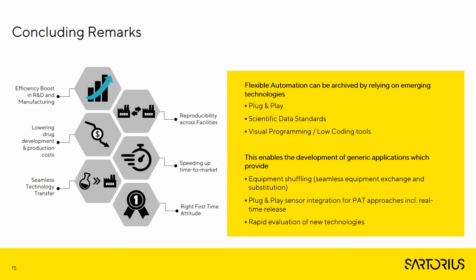This is not limited to robotic automation, and does equally apply to data-driven knowledge extraction via machine learning approaches. The removal of repetitive and tedious data wrangling tasks allows scientists to focus on creative solutions for complex problems again. Business value can be created by democratizing tasks which were previously performed by subject matter experts such as data scientists and IT integrators. These concepts enable the evaluation and rapid integration of new equipment and technologies. They facilitate the change of scale in commercial production environments and allow the fast prototyping of an R&D laboratory workflow.